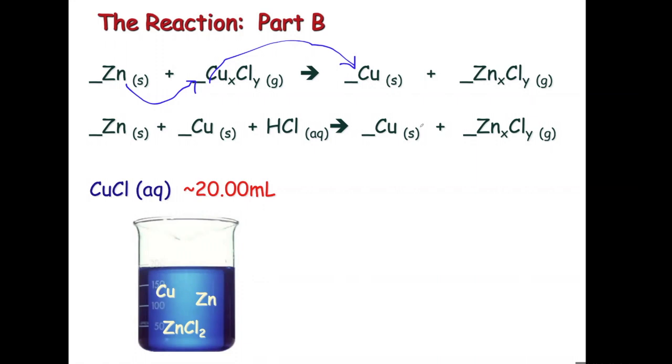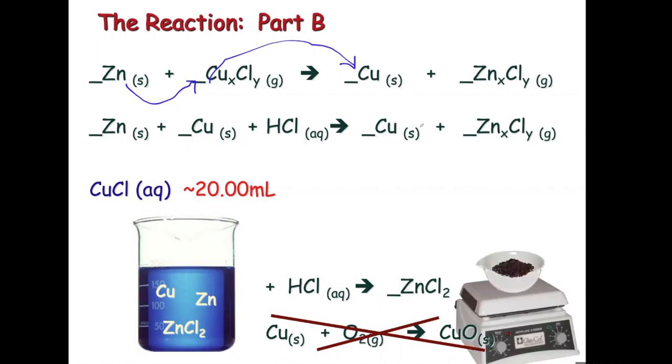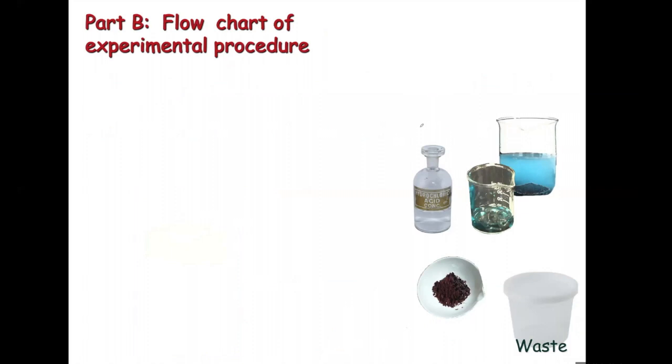The solids are generally bronze, but when you convert it to its ionic form, that is its charged form, it's generally blue, powder blue. So in this reaction, we're going to add hydrochloric acid and you guys are going to get this chemical and you guys are going to figure out that formula based on the data.